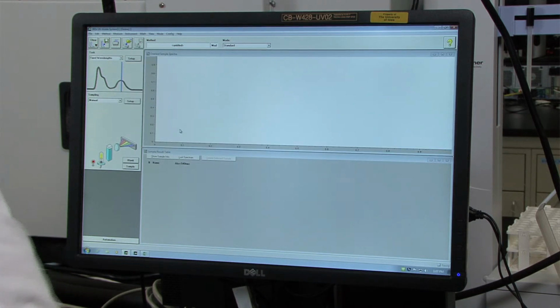and select OK. After you've found the optimal concentration of the inhibitor, begin by varying the volume of the substrate to collect data necessary to create a Lineweaver-Burk plot. You should also prepare two solutions where the inhibitor concentrations are near the optimal one, but differ by a factor of 2 from one another.